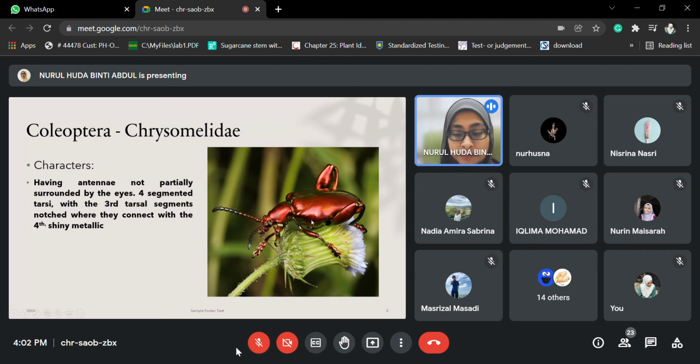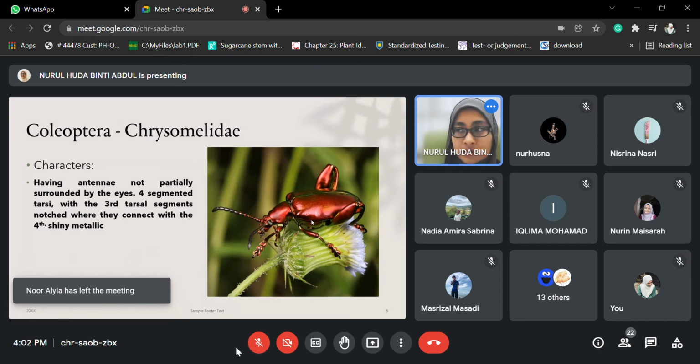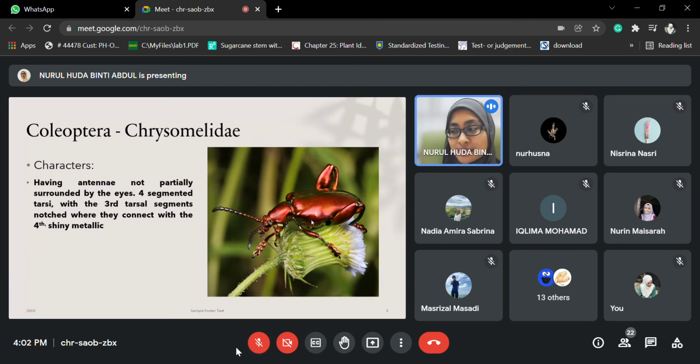Okay, tadi remember our 15-second quiz, okay, the one that I show picture macam tortoise beetle tu, memang tortoise beetle lah, macam kura-kura kan, rather than ladybugs, okay, yang kamu nampak dia punya bentuk badan lain sikit. Okay, tortoise beetle tu pun juga chrysomeli. If you realize, even pun dia transparent, it's actually a bit more shiny metallic. Okay, so for chrysomeli dia, you cannot expect that dia punya shape is similar even though dia dalam satu family.